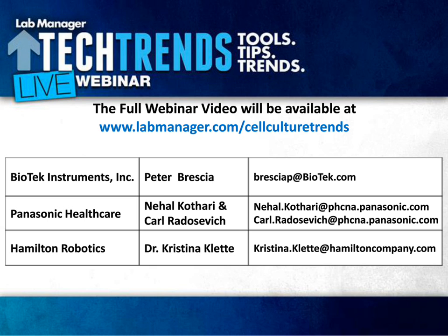Carl, I'll direct this next question at you. How frequently should you be calibrating your CO2 sensor and temperature controls on your incubator? That is a great question. Absolutely. If you have a new incubator coming into a lab, 100% have it calibrated. A lot of times your sales rep or the technician that's actually setting up the incubator will do that. But you should really confirm that it is calibrated with CO2 and temp especially.